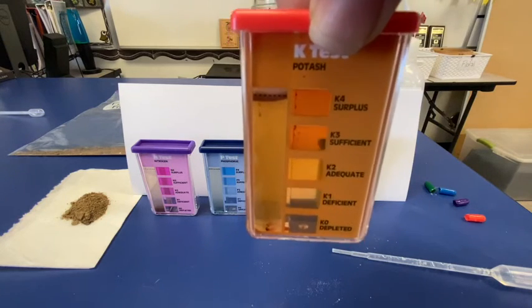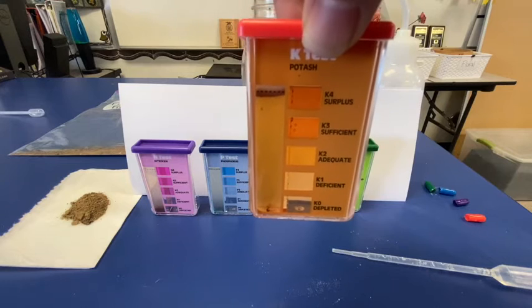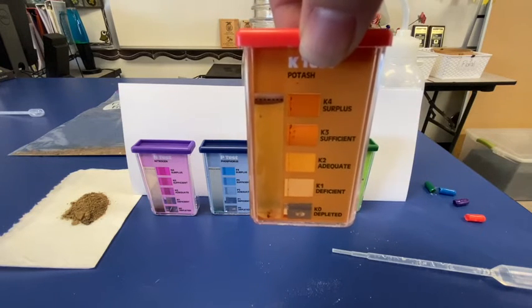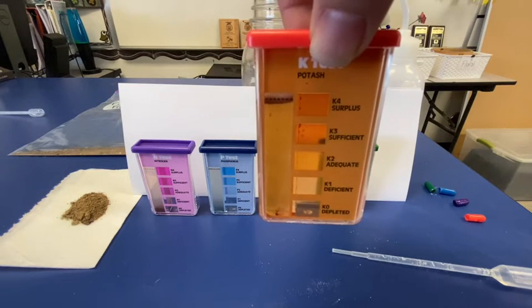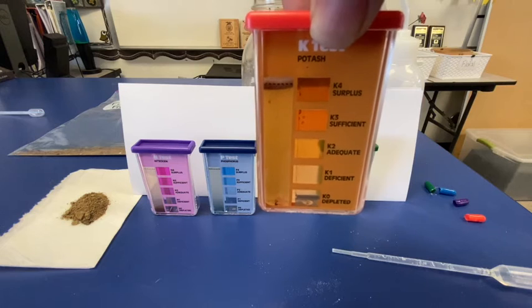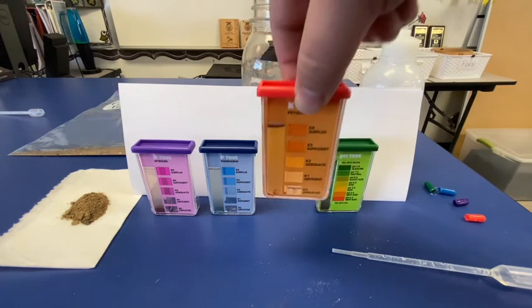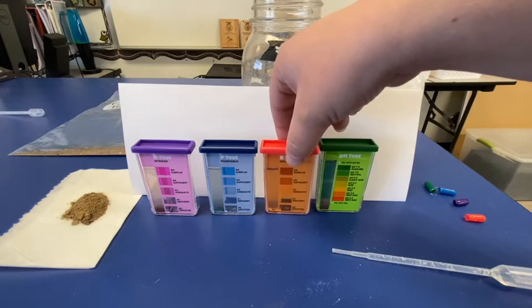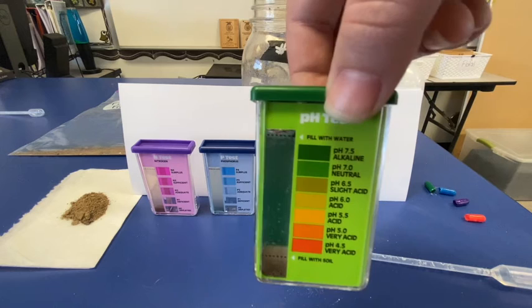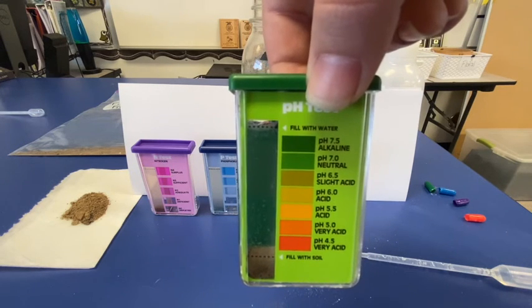Our potassium, our potash. What do we think? Is that a K4 surplus, K3 sufficient, K2 adequate, K1 deficient, or K0 depleted? What color do we see? And our pH. What do we think? What color is this? What number on the pH scale does this signify?